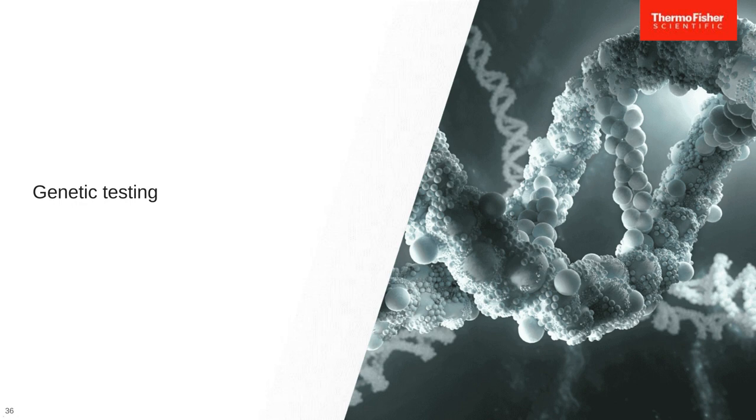Genetic testing, of course, focusing on DNA extraction with the downstream application examples of genotyping and also exome sequencing workflows.